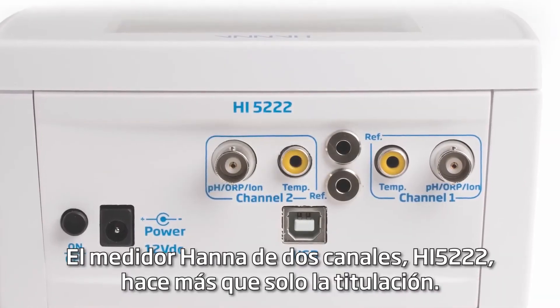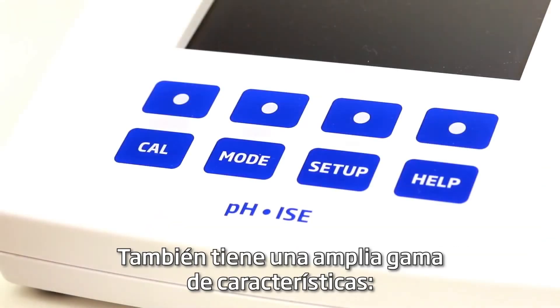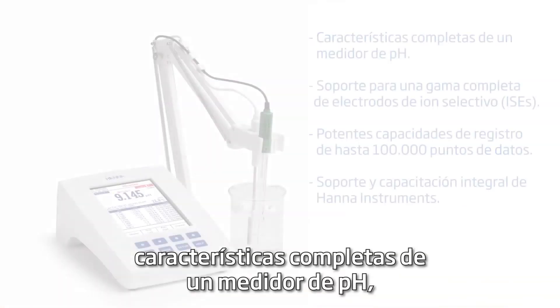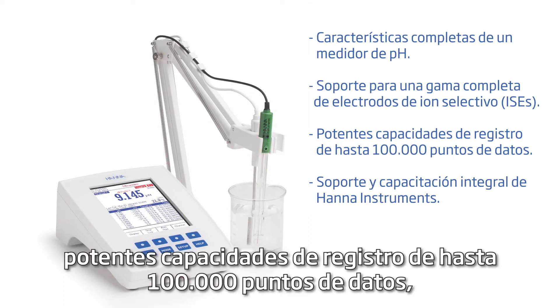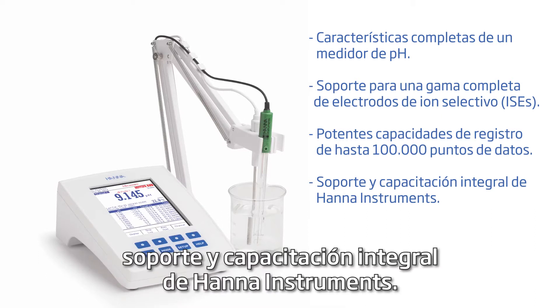The HANA HI5222 two-channel meter does more than just titration. It also has a wide range of features: a fully featured pH meter, support for a full range of ion-selective electrodes (ISEs), powerful logging capabilities up to 100,000 data points, and HANA Instruments comprehensive support and training.